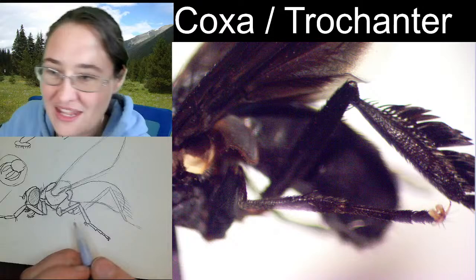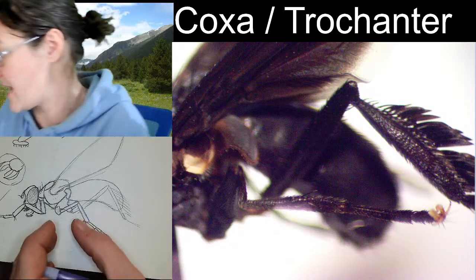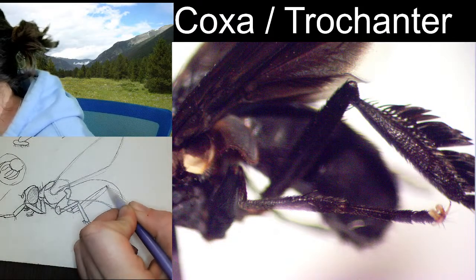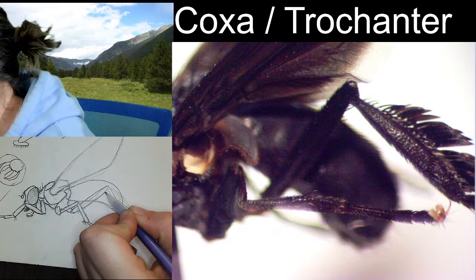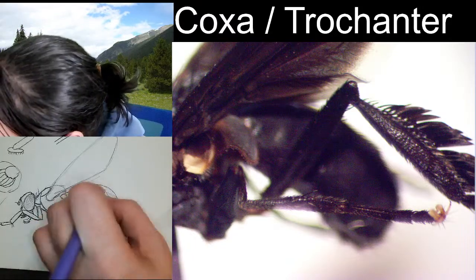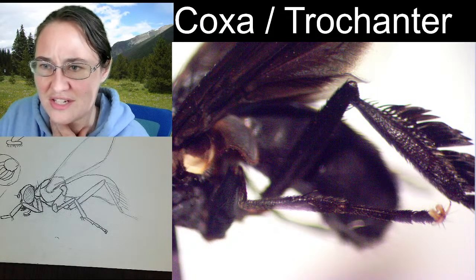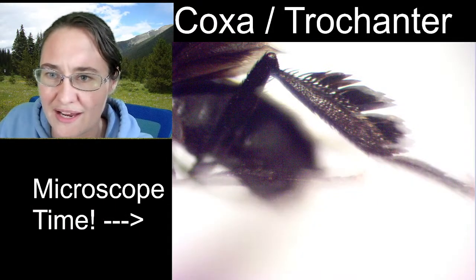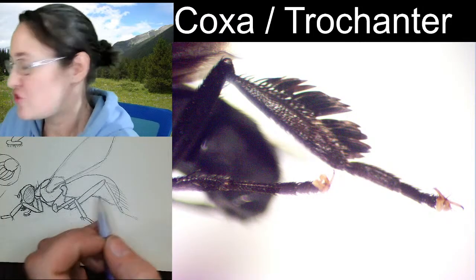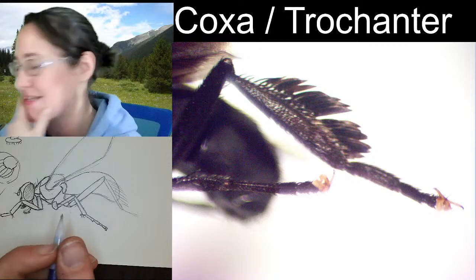All right, so this femur is coming all the way up. It's a really long femur in comparison to the other ones. This femur is like double in length of the other femurs. So the, what we would say, the metafemur. The metafemur is fairly wide and also double in length of the pro and the mesofemurs. And then the tibia, oddly enough, it looks like it starts kind of thin and then gets wider and narrows back down again. Look how cool it is! So that hind tibia, it reminds me of like a mohawk. I'm pretty sure that this fly has a mohawk on its hind leg.